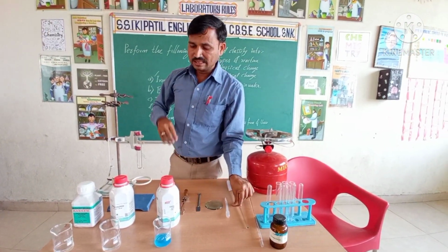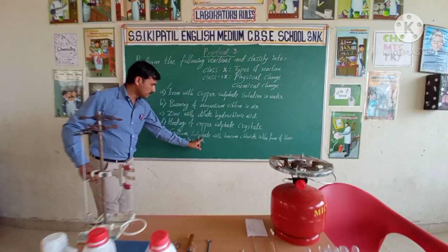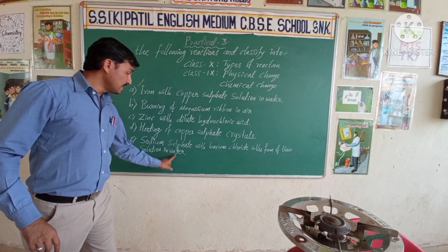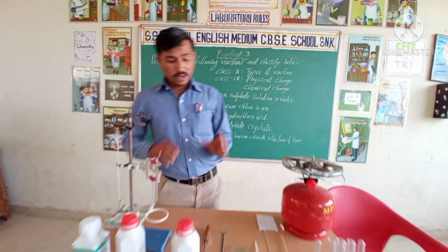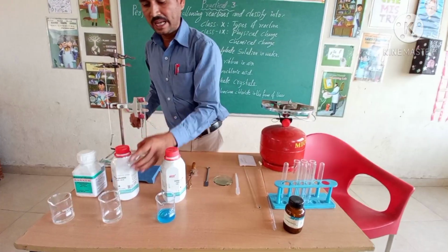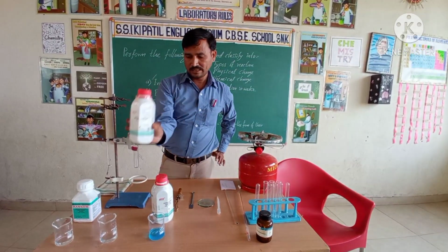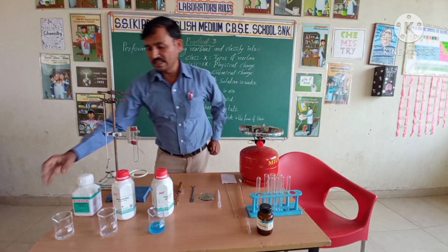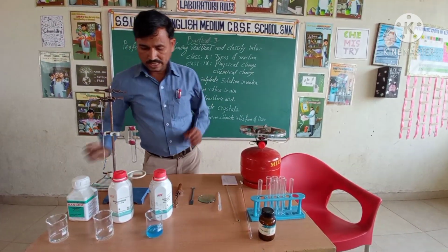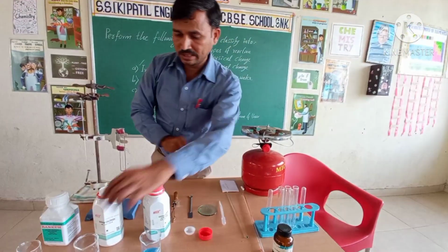Next, the same thing we will perform for the other solutions first: sodium sulphate with barium chloride, to perform their solutions in water. So we need to make those solutions also, along with beaker number B and beaker number C. In beaker number B, here I took the sample of barium chloride. Right? Yes, we will prepare this, and in beaker C we will prepare sodium sulphate. Okay, so here we need to make solutions of those also, students, and perform.